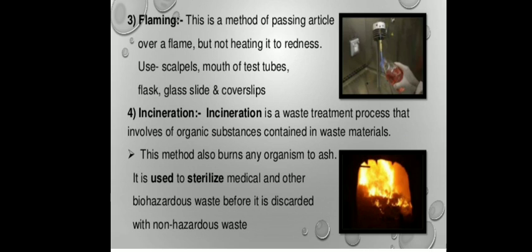material which we have to sterilize is passed through the flame. With the flame, what we have to do is, whatever material we have to sterilize, we just pass it. But while passing through the flame, it is not necessary to hold it till it gets red. We do not have to hold it till redness comes; we only have to move it over the flame. And different types of scalpels are there, then glasswares are there, glass slides are there, cover slips are there.